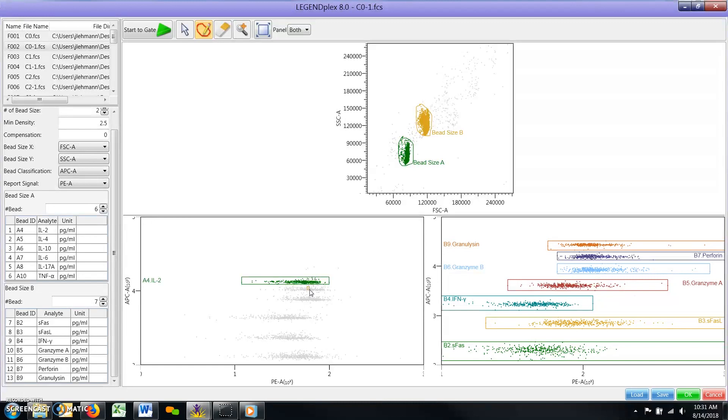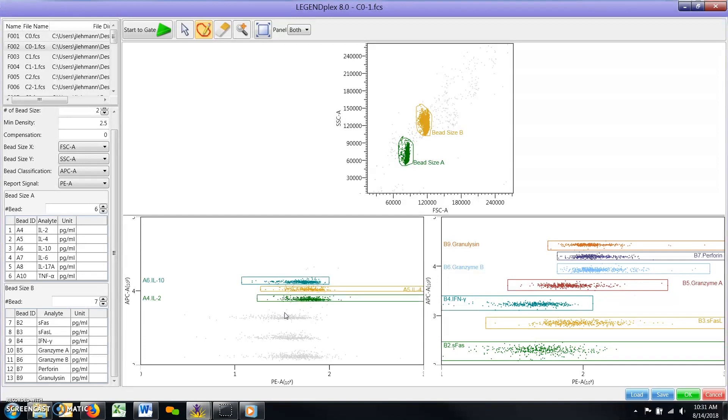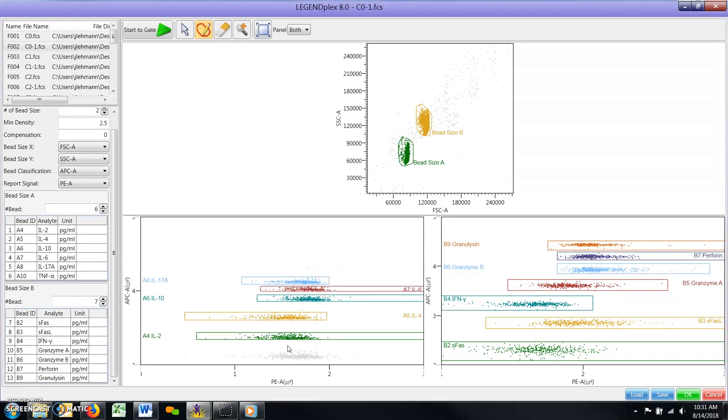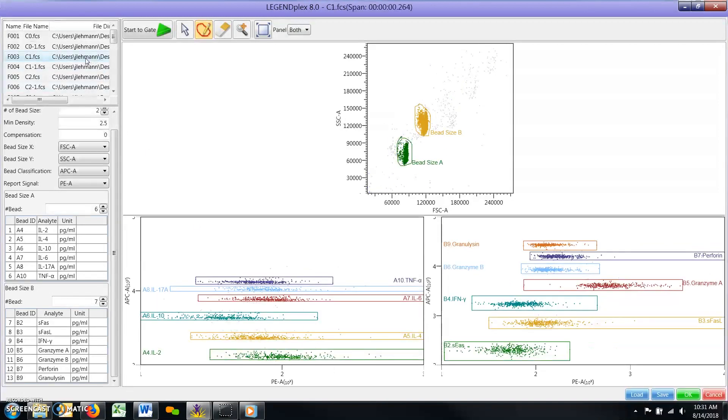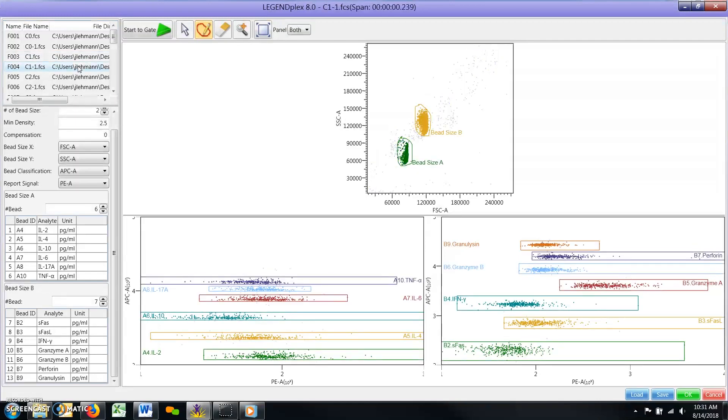Once you are satisfied with the global gates, review how the software has applied them to your remaining FCS files by clicking through the list found in the upper left of the window. Make a note of any FCS files with gates that need to be adjusted.